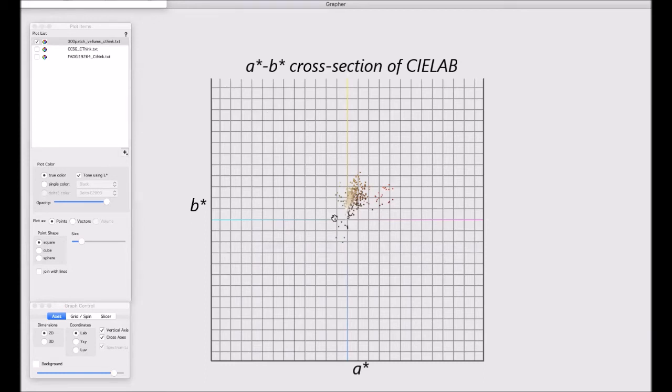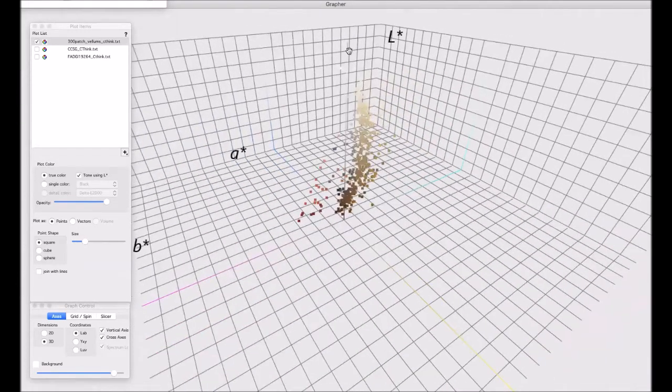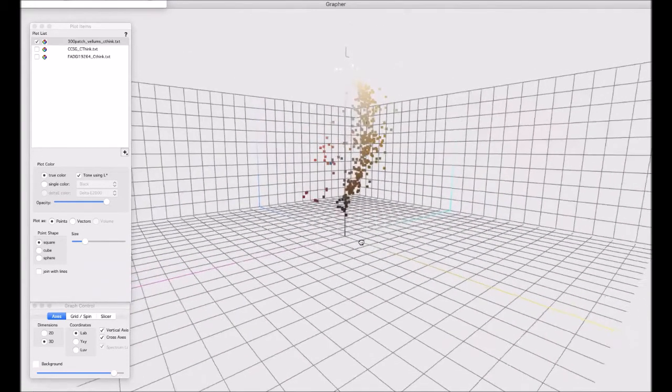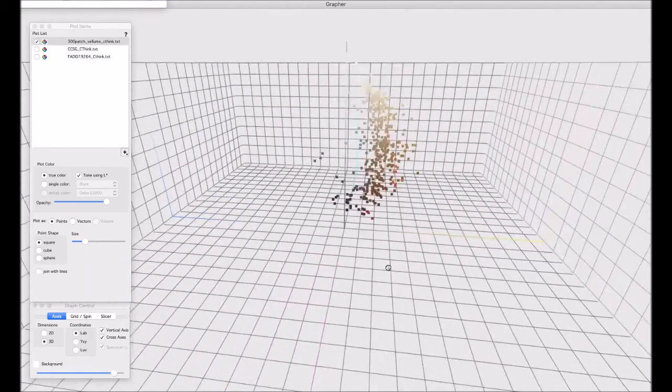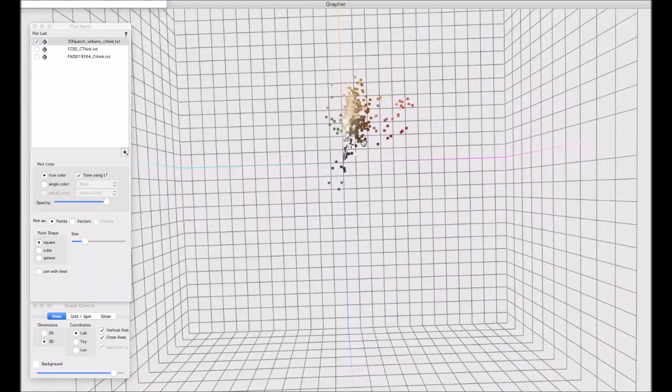And you say, so how do we determine lightness or darkness? Well, we're going to do that by going into this 3D mode. So that's what we're going to do right now. We're going to see how LAB is rendered in 3D. And there you go. So let this swing around. High lightness, whites, low lightness, blacks down here. And that is all the measurements. Notice it's a very narrow hue angle, right in this yellow brown. This is like an 80 degree to 90 degree hue angle, just to give you some terminology.